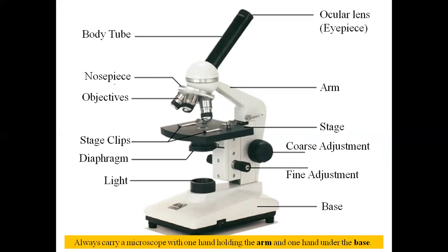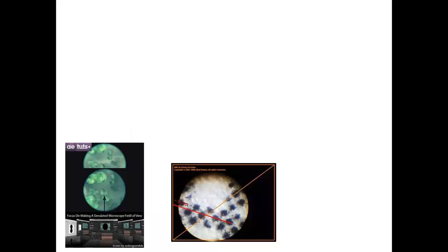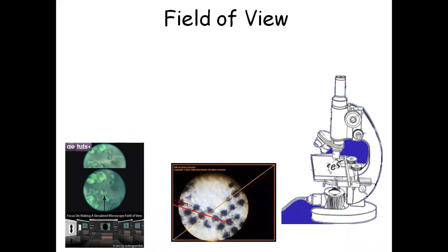So here is one important note: always carry the microscope with one hand holding the arm and one hand under the base, which is most important.